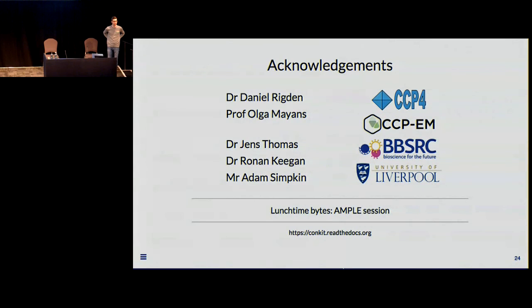Okay, so it might be a bit out there, but have you tried using this with, say, low complexity regions that don't have necessarily any canonically folded domain, to look for contacts within those regions at all? So, in general, your question is more about applications and how you can exploit contact predictions. I'm not entirely sure whether anyone else has done it. We haven't personally. But certainly if you used ConKit and looked at your predictions in a plotted contact map, it would allow you to see, for example, contact dense regions very easily. And this is very similar to defining domain boundaries, because contacts are either found intramolecularly or intermolecularly, and the regions in between should only have very few, if any at all.